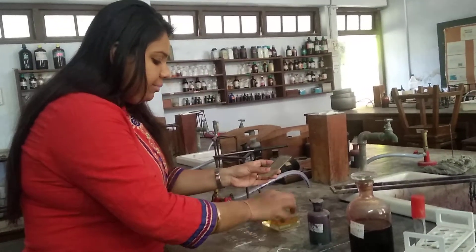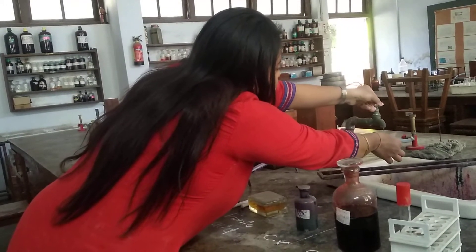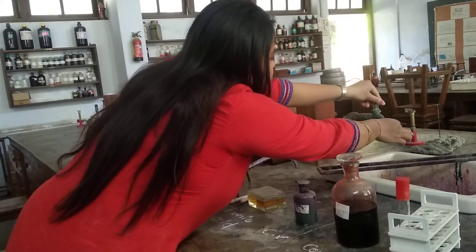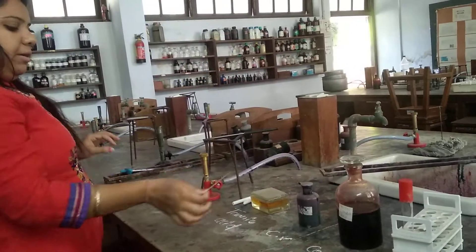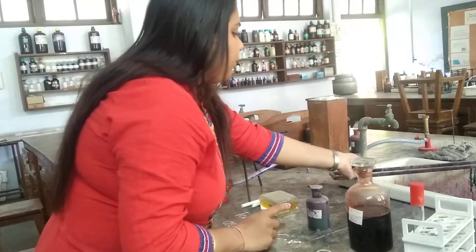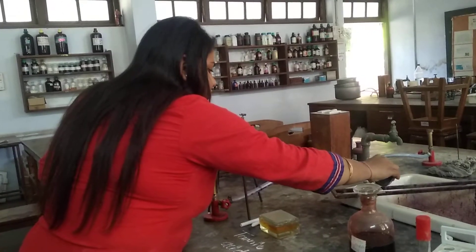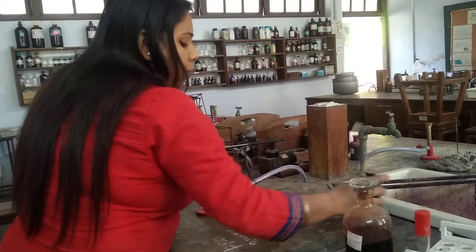Now, after removing the slide, we will gently give a wash to that slide. We will make sure that we do not dry it. So, after adding 1-2 drops of water, we will flood this slide with the crystal violet solution. Placing this slide on the slide rack, we will pour the crystal violet solution and keep it for a minimum of 1-2 minutes.